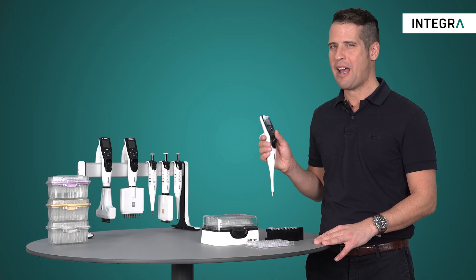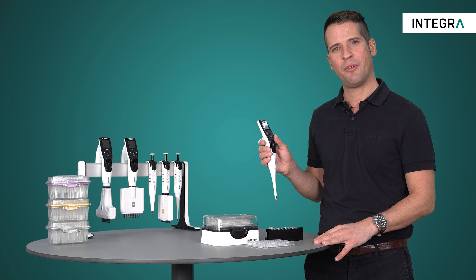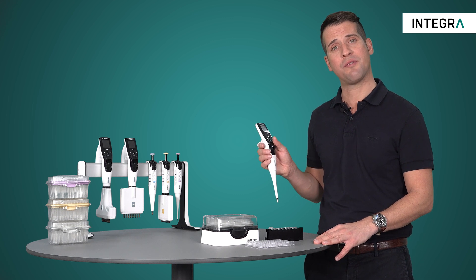So easy to use, pipet mode is perfect for simple, fast, and reproducible transfers of liquids electronically.